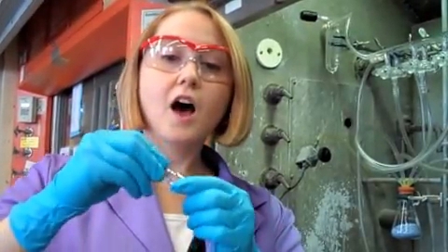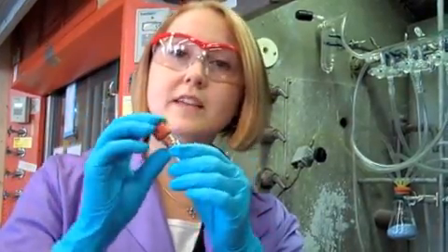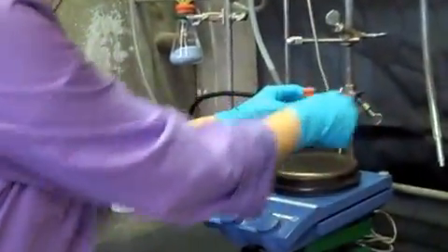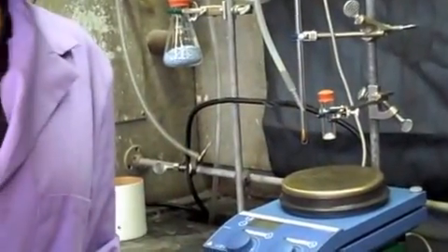First, I'll fit the vial with the septum and we'll clamp it over here. I'll first demonstrate how to purge by vacuum and backfilling with nitrogen. However, this isn't a good method for this particular titration. You'll see why in just a second.